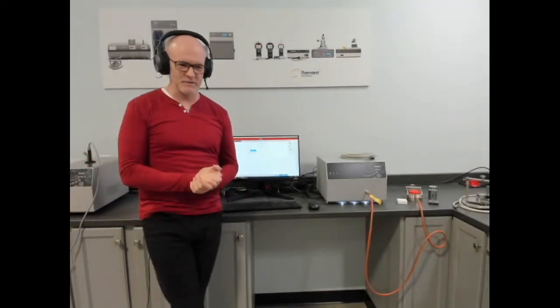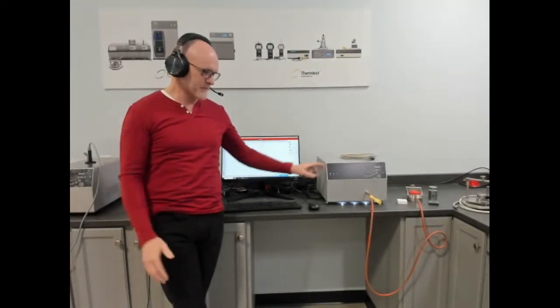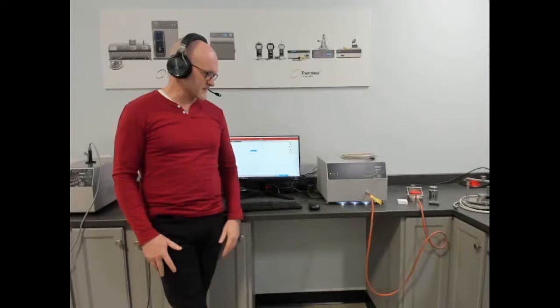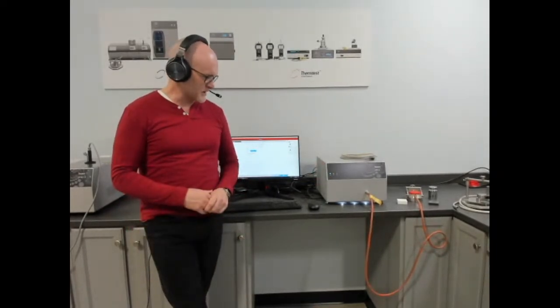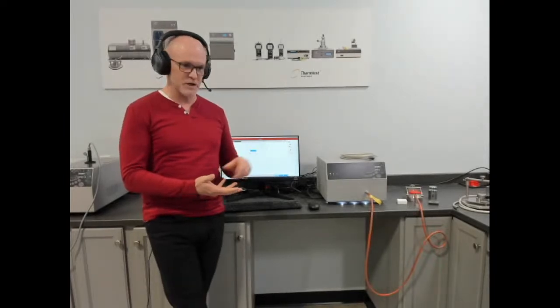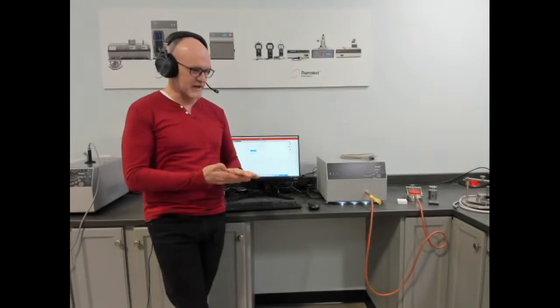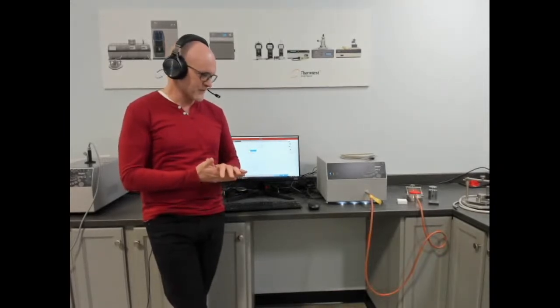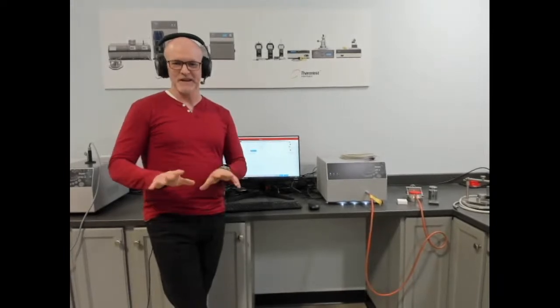Today we'll be talking about the MTPS sensor available on our new MPV. We'll show a setup of a sample for bulk measurement, as well as the MTPS sensor comes with other modules to measure other types of sample dimensions, such as slab, anisotropic, and 1D. But before we do that, classic demonstration corner.